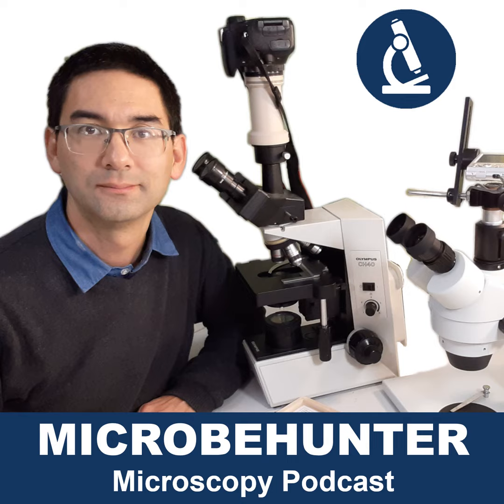If a specimen doesn't meet those criteria, you probably want a stereo microscope instead. Stereo microscopy is something I want to encourage people to get more involved with, because it allows you to look at specimens directly without any processing at all. Find an insect, a fly — just put it under the stereo microscope and you get a three-dimensional, very immersive and impressive image. You don't always need complex laboratory techniques. In most cases, my microscope slides can be prepared in less than one or two minutes: take the sample, put it on the slide, cover glass on top, and it goes under the microscope. Happy microbe hunting — bye bye!